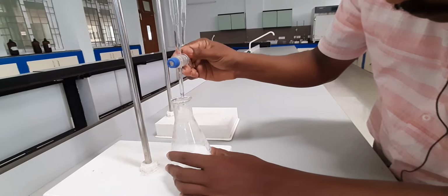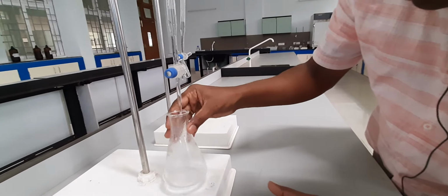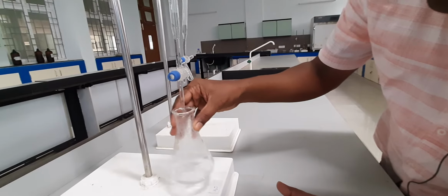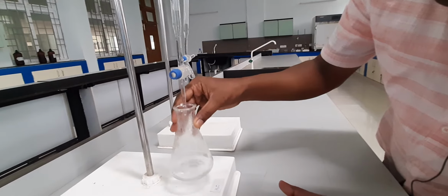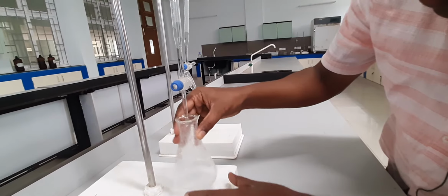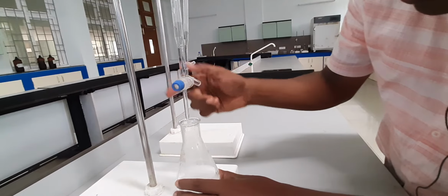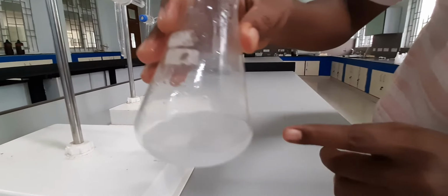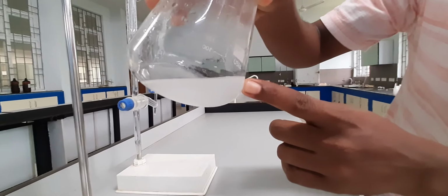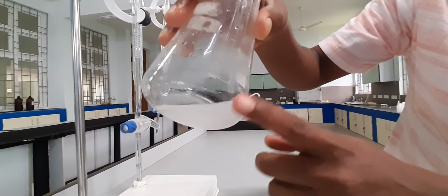You can notice here, I am sure that most of you would have noticed, there is a turbidity. Earlier it was a clear solution.